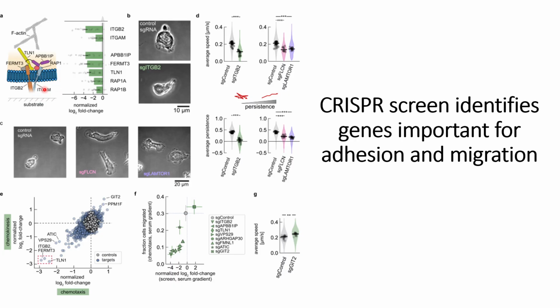So they used the ITG knockout, that is ITGB2 knockout, and checked its effect using stable cell lines of the ITGB2 knockout in these two different migration conditions. The control cells are adhered to the surface like this, whereas the ITGB2 knockout cells are loosely adhered. It can be seen here.